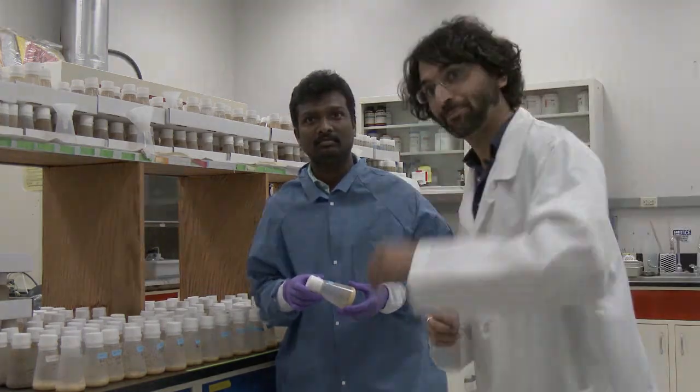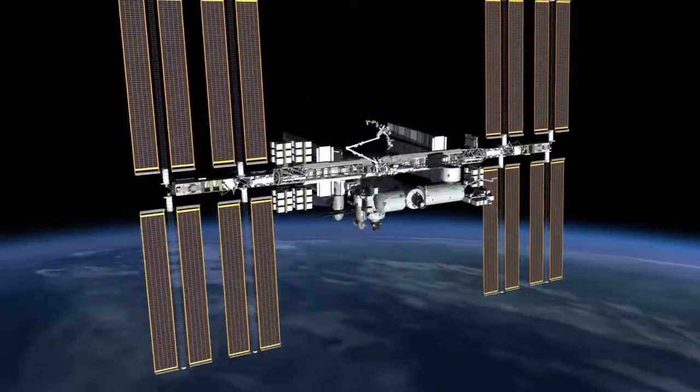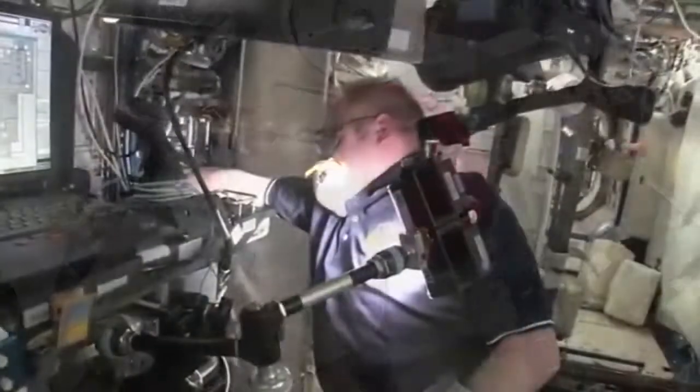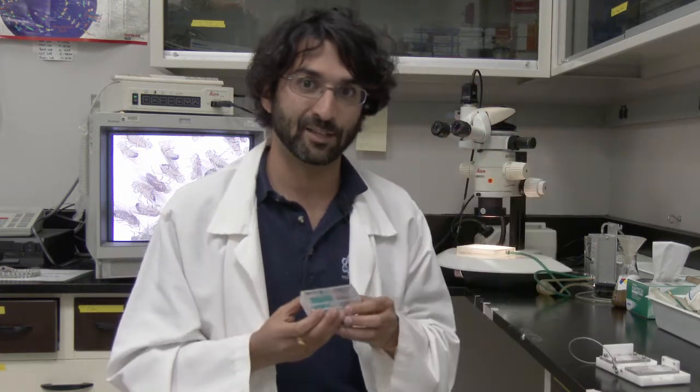Come check it out. Okay, so now we're still in the Fruit Fly Lab, and we're going to talk about the hardware that is used to satisfy the scientific requirements that were given to us by Dr. Hosamani and his team. Now, before we do that, let's talk a little bit about the International Space Station and where we'll be located. The location in the International Space Station within which our observation system needs to fit in has already been given to us. That means we cannot build it in any kind of shape or form. It needs to fit inside slots that already exist on the space station.